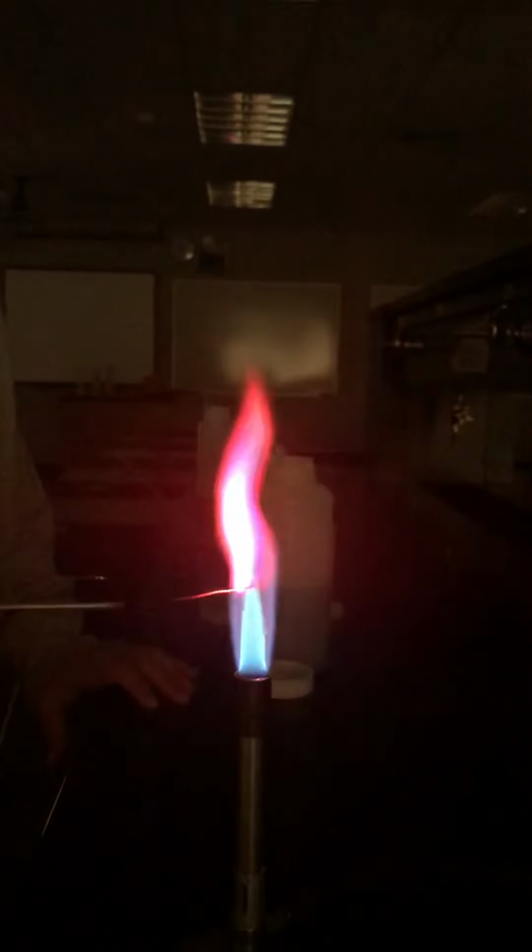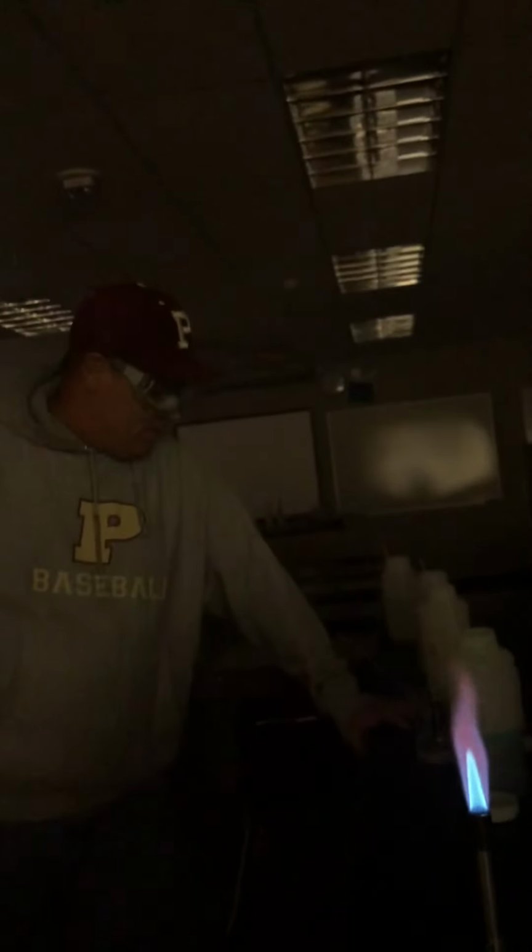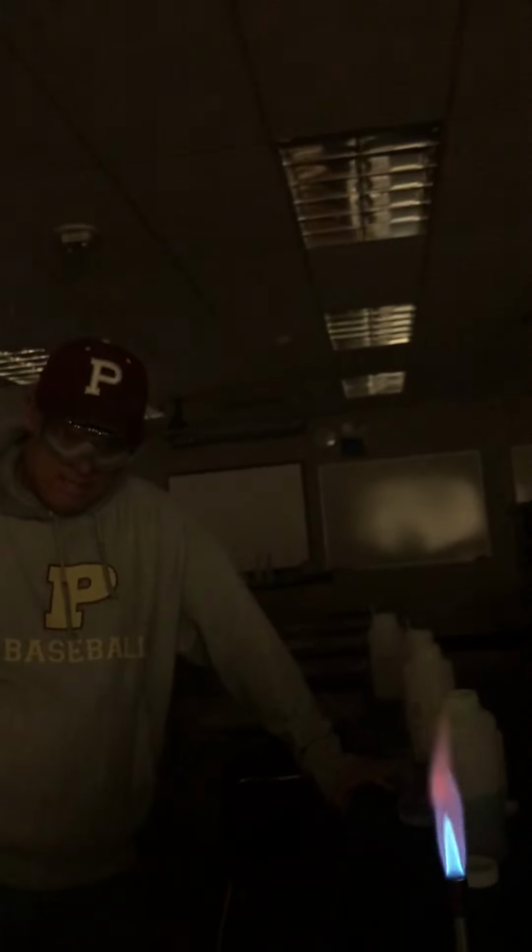Okay, let's go. So, lithium. Lithium is red. That's a great one. Red. Look at that. Oh, that's beautiful. So, write down lithium is red.